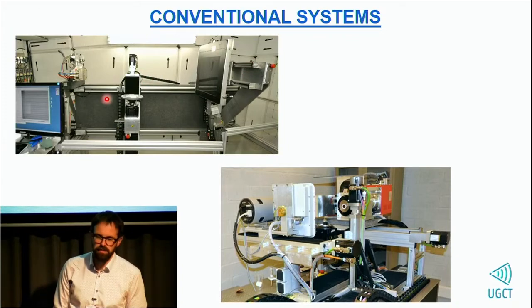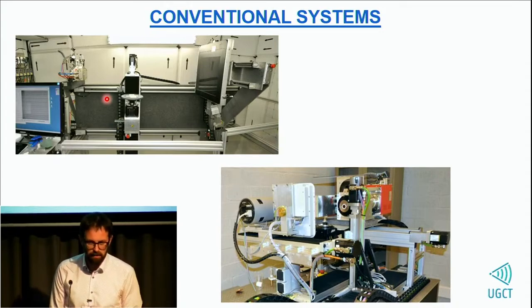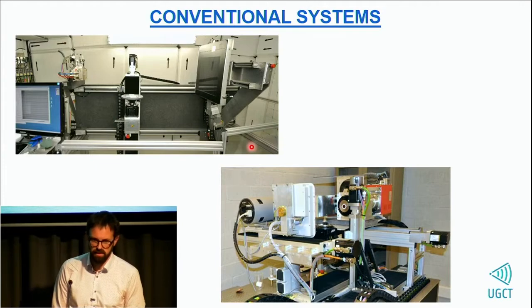It can go down to 3 micron resolution, of course, only for small objects. But on the other side, we can do very big objects. Full human lungs, for example, are things that we also did quite often that are not in the presentation, but that we do relatively often on this system. On the other hand, as I mentioned, we go multi-scale, so we also want the very high resolution.